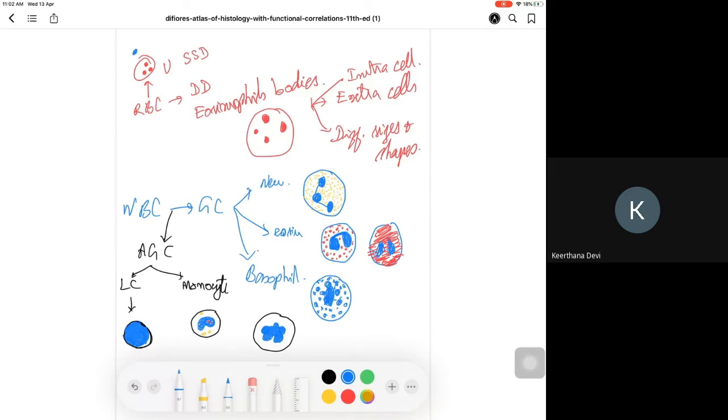The same nucleus twisted on itself is the megakaryocyte, and you can see some bubbles sitting outside. The cytoplasmic membrane may be irregular, and these are all the future platelets. They will shed off like platelets. They are the cytoplasmic fragments of the megakaryocytes.